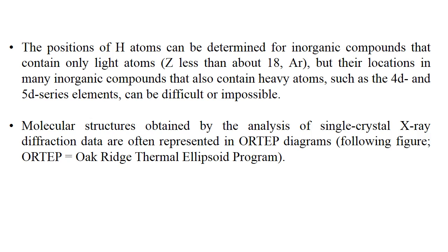Molecular structures obtained by the analysis of single-crystal X-ray diffraction data are often represented in ORTEP diagrams. ORTEP is actually the Oak Ridge Thermal Ellipsoid Program.